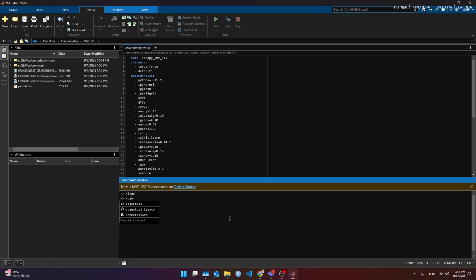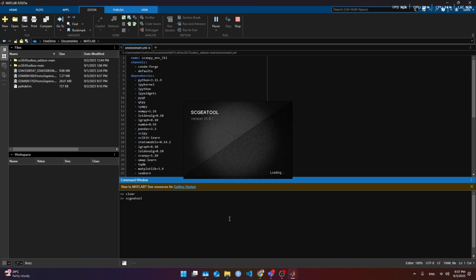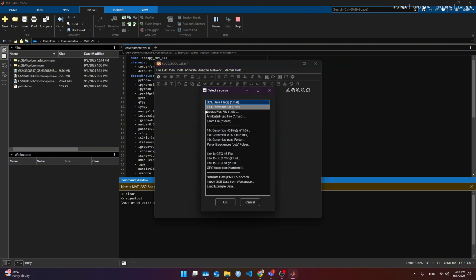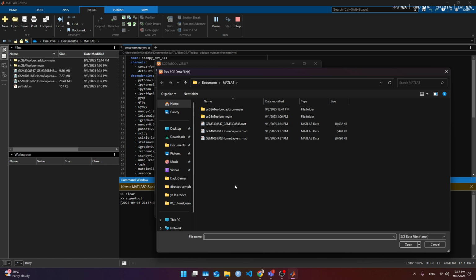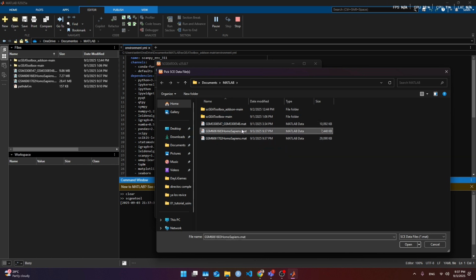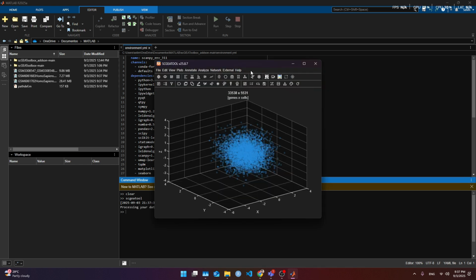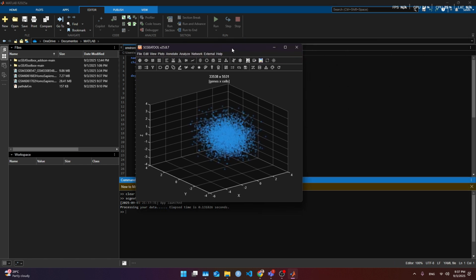What we can do now is this. There are two things. You can open individual files, type in the toolbox, import data, and load the mat file. So I'll process the first one. I'm gonna process this first one, and I'm gonna show you two things. One is that you can QC this in the first. So wait a second. All right, I just verified what I needed.